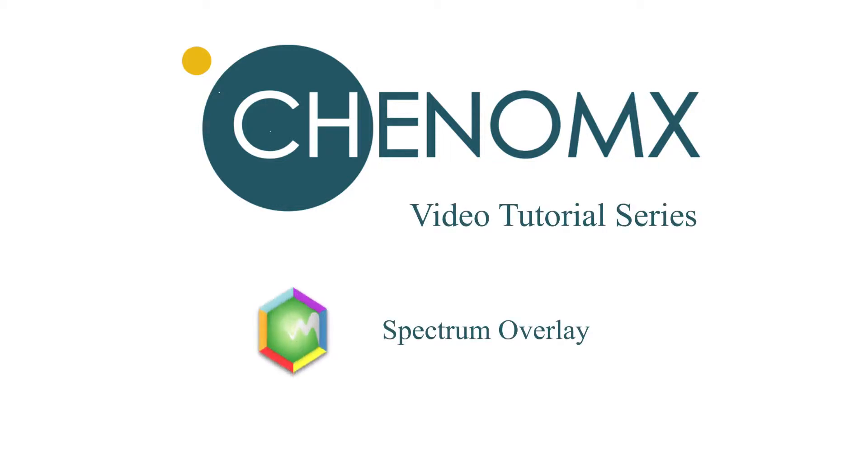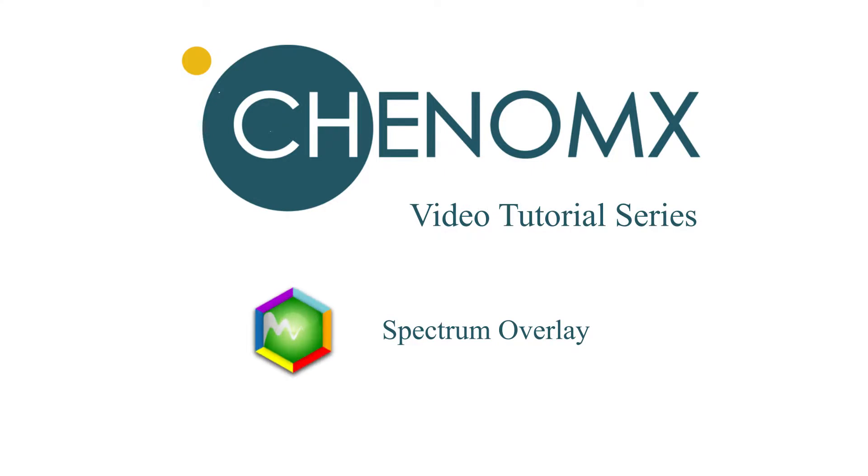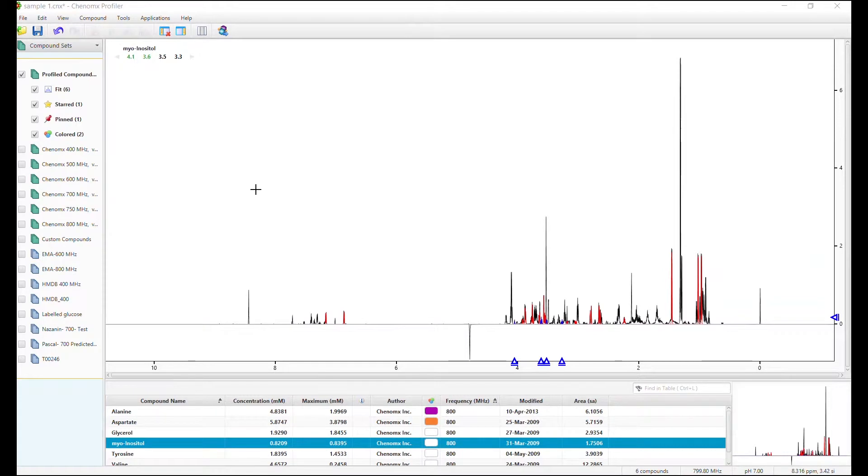Welcome to the Chenomx video tutorial series. In this video I'm going to show you the spectrum overlay feature. This feature allows you to visually compare two or more spectra or monitor changes in a series of spectra.